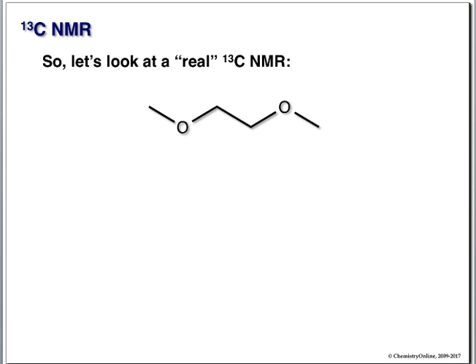Of course there is. Split this little sucker right here, right? This half is the same as this half. Down here we have a simple methyl, but it's next to an oxygen, so it's going to be moved down a bit. This is also next to an oxygen, and it's secondary, so it's going to be moved down probably a bit more.